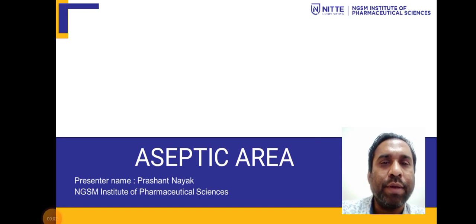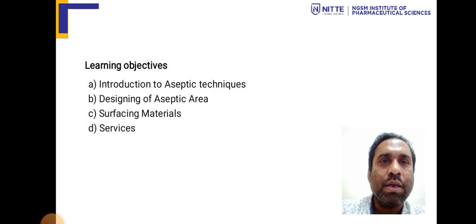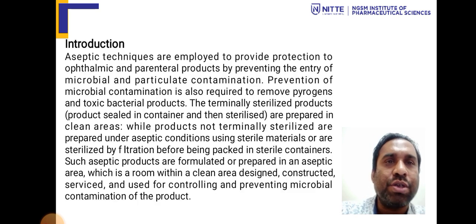Good morning, everyone. Today we are going to have a class on aseptic area. So, what are the learning objectives of today's class? I'll be having a discussion on introduction, what are the aseptic techniques, what is the designing of an aseptic area, surfacing material, and services. Let us start with the introduction.